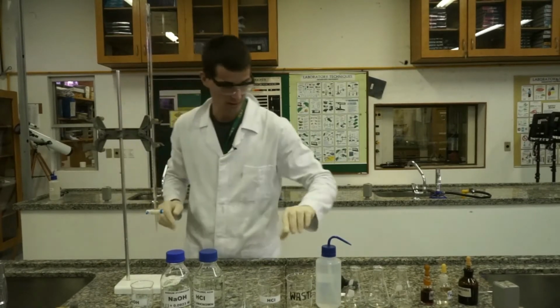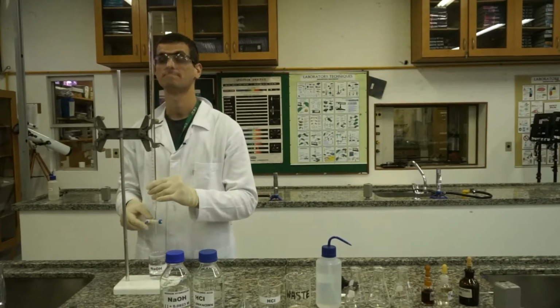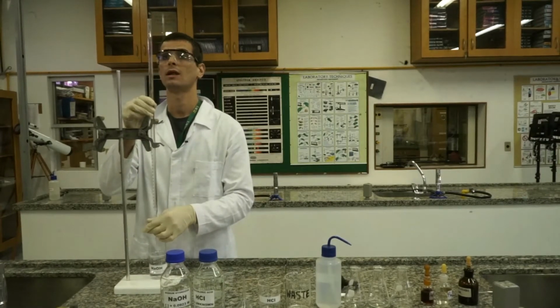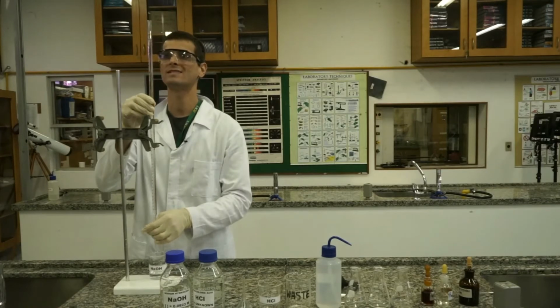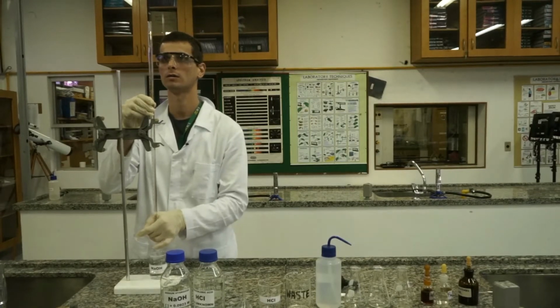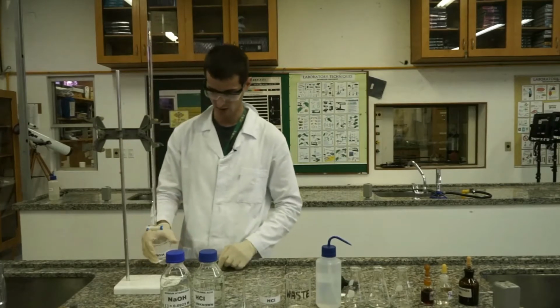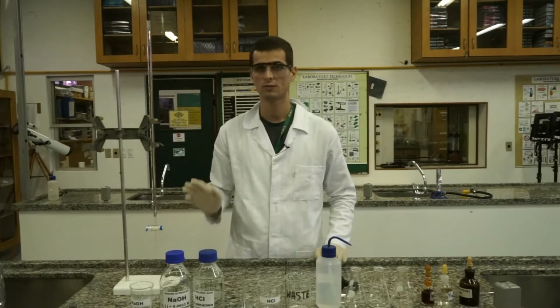Now, let me get the support. I'm going to put it here. I'm going to let it out a little, so the bottom of the meniscus sits on the 0 mark. It must be done at eye level. Done. Now my titrant is ready.